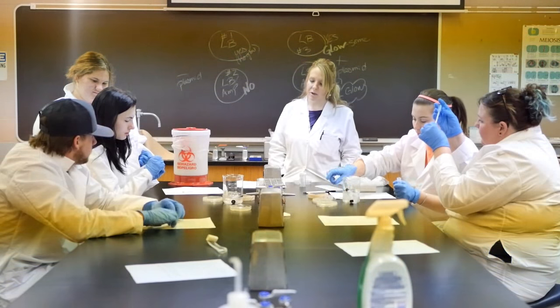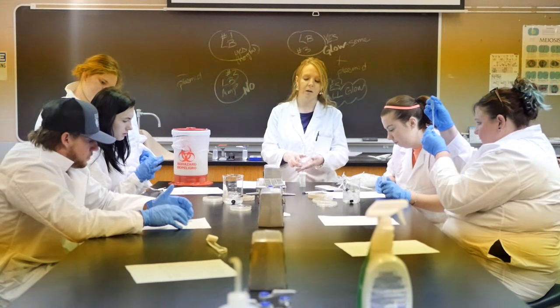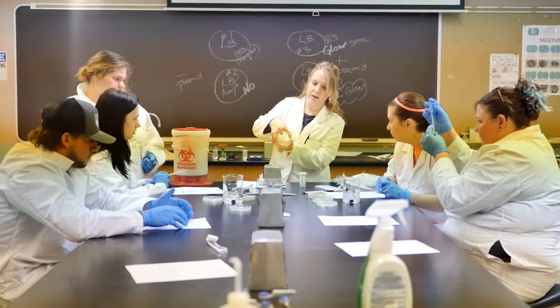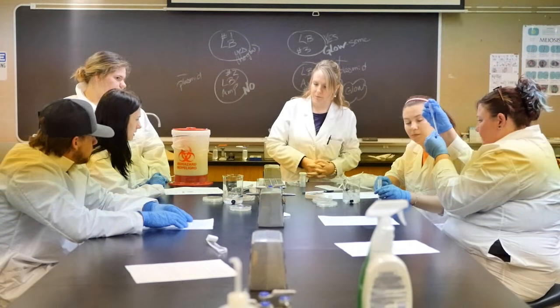When you are done with the beads, step 14, letter A, tells you how to get rid of them. You're going to clamshell, which means you open up your plate like this and allow them to just trickle out. I'll give you a beaker to put them in, and from there I will sterilize them in the autoclave.